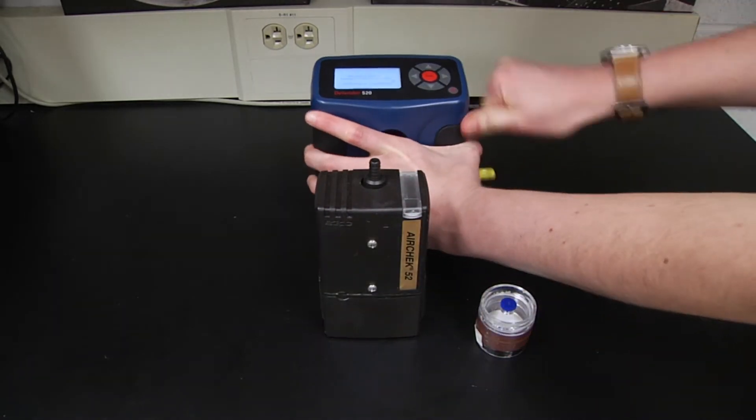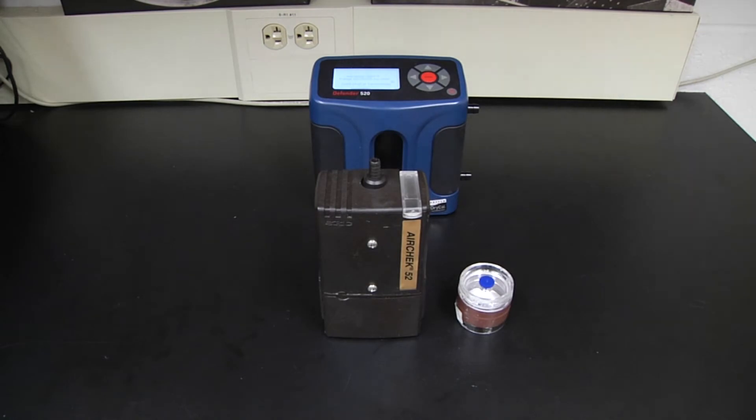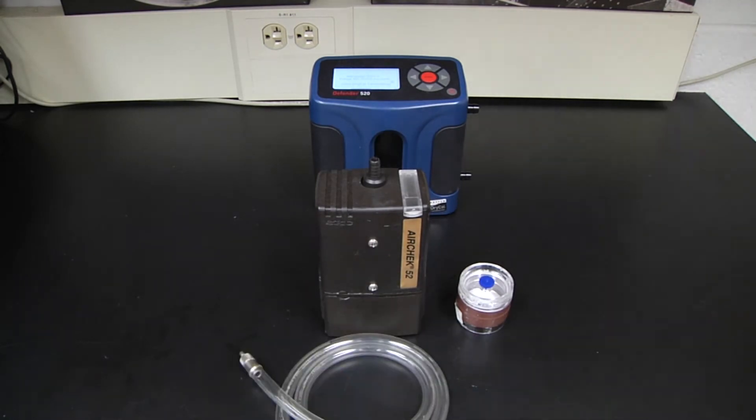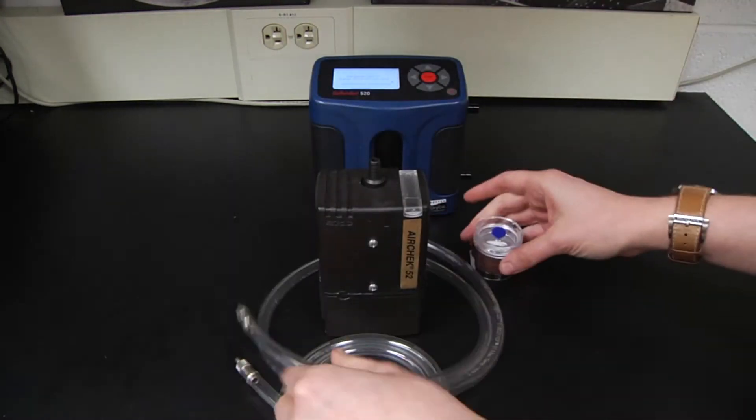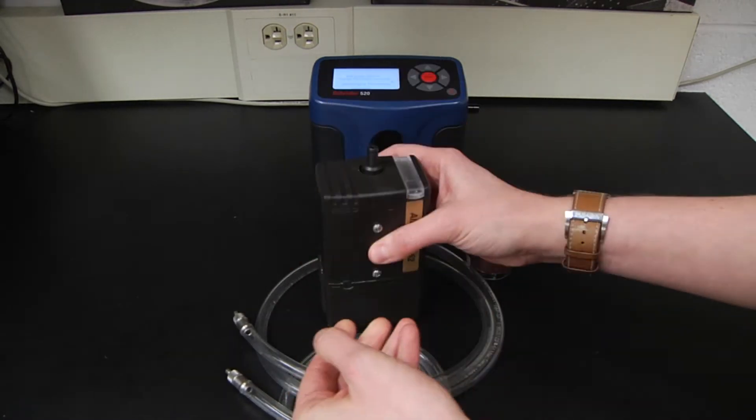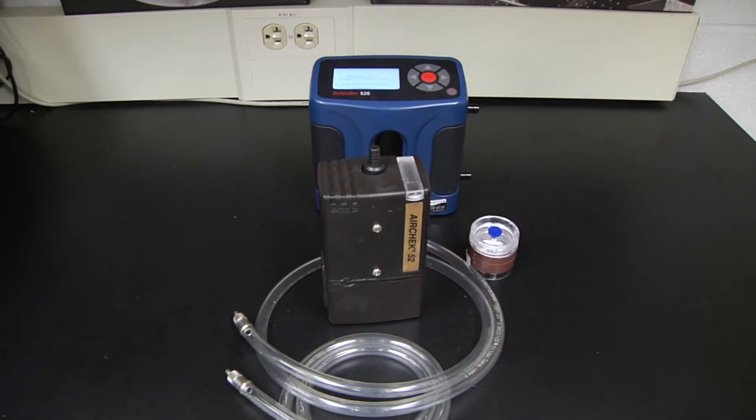During this time we'll prepare our media or sampling cassettes and inspect our tubing for cracks and leaks. Also inspect your pump to verify that it appears to be working and isn't on its last leg. Make sure that it doesn't look like it's been recently dropped.